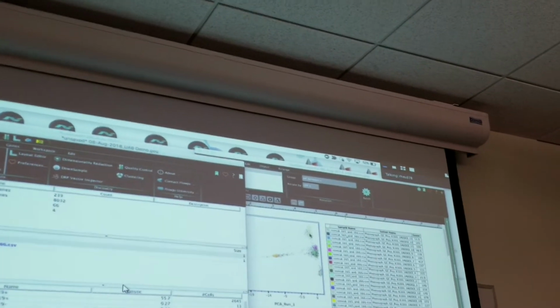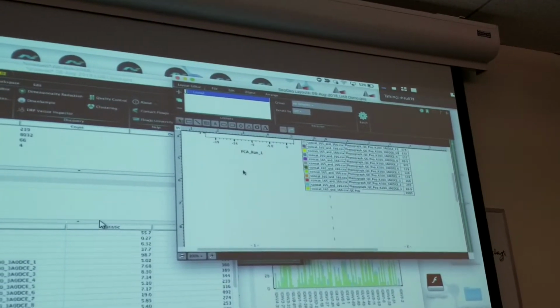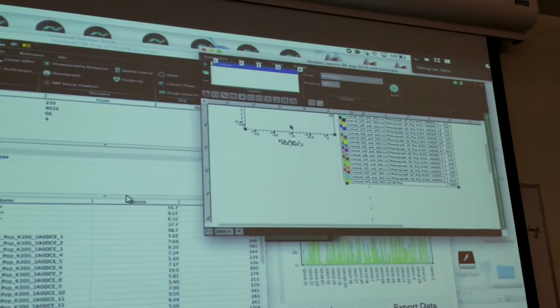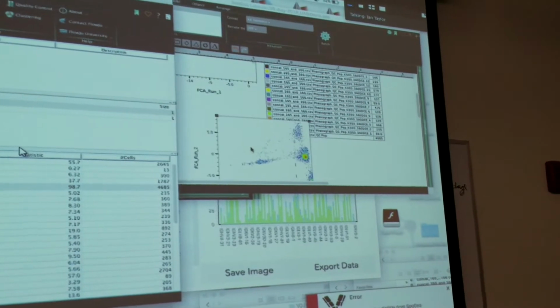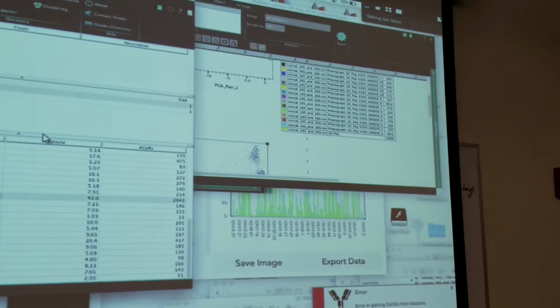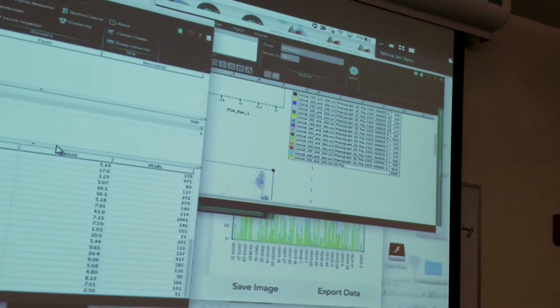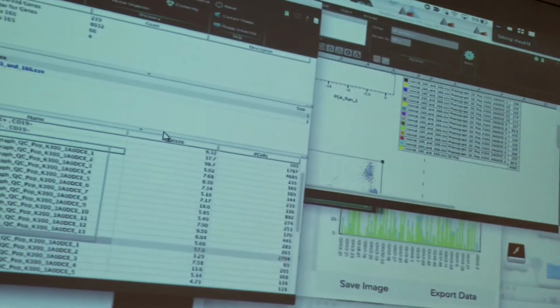So is that 165 versus 166 right there? Is that what you got? This is actually 165 phenograph versus 166 phenograph, but I'm not sure I like it very much. I think what I want to do, probably, is start with where in these principal components 165 and 166 are different, or distinguishing from one another, if anywhere, because they might perfectly overlap. Oh, a lot of them overlap, I'm sure.